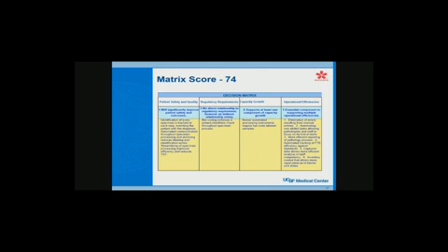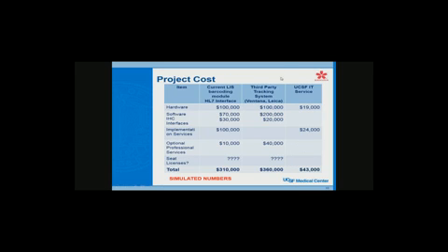And then operational efficiencies had to do more with making people more efficient, not having to do so much filling out of forms, spending time doing that. Reduce time sorting blocks, checking off blocks, that kind of thing, instead of having people do what they're trained to do instead of clerical type work. And plus, we can capture a lot of data automatically rather than having people write it down or trusting people to write down the right numbers. So we can pull up reports and get all kinds of nice information now. So that's kind of the process we went through to justify the system, and we managed to get a high enough score to get put on our capital approval list.